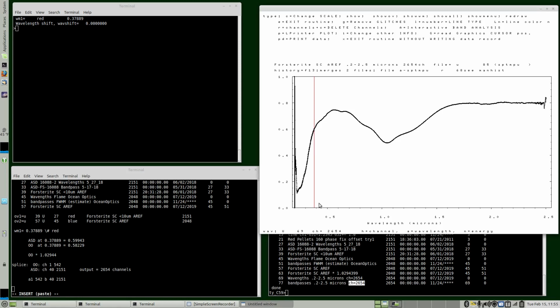So there's some spurious data out here and some spurious data here. It is implausible for this to be real, so I suspect that it's wrong, and it's the end of the spectrometer where the signal's low. So let's chop off the data here and chop off the data there. Now, Specpr, one way to do that would be to decimate the wavelengths and have a reduced wavelength set that only covers from here out to just before 2.5. But every spectrum will have different idiosyncrasies, and the data that you need to reject may be at different wavelengths.